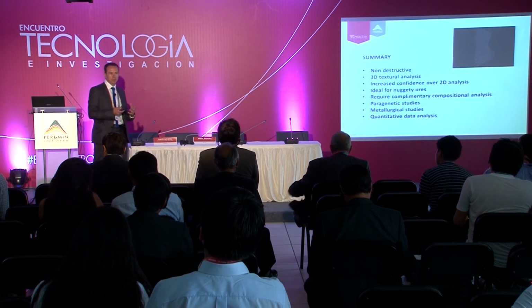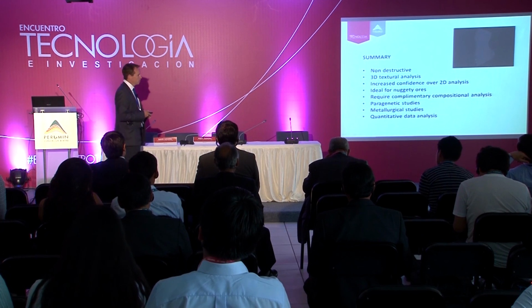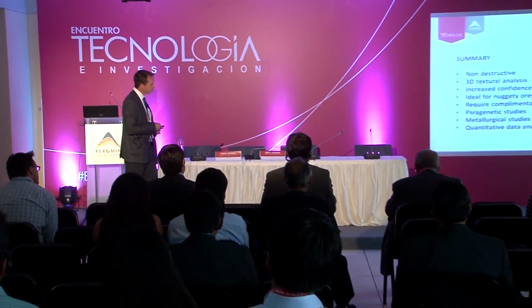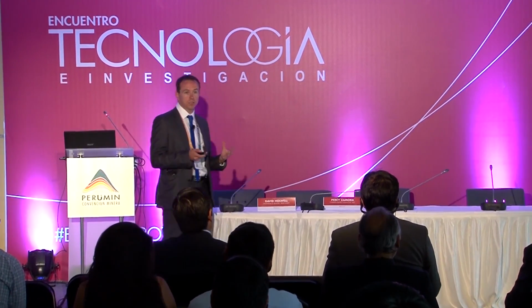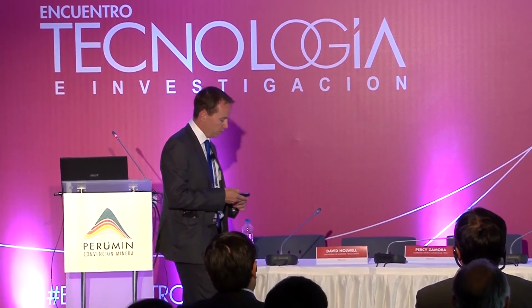It adds another level to our understanding of how these mineralized systems and mineral associations form. It can be applied to metallurgical studies, the textures, the distribution of different phases, and we can do quantitative analysis on that, either volumetrically or grain by grain in terms of size.